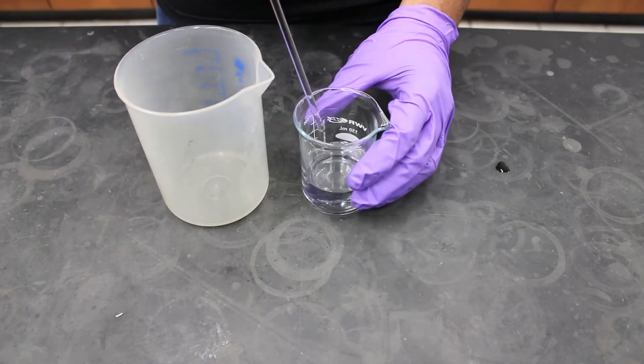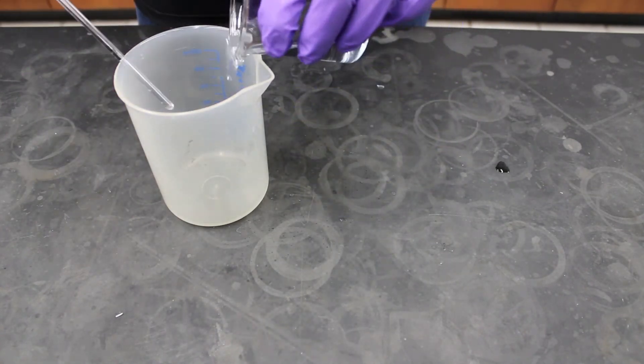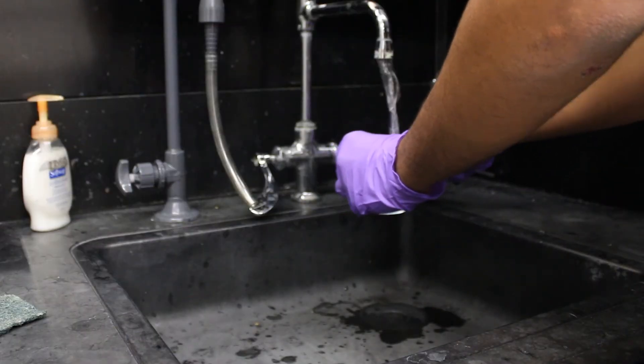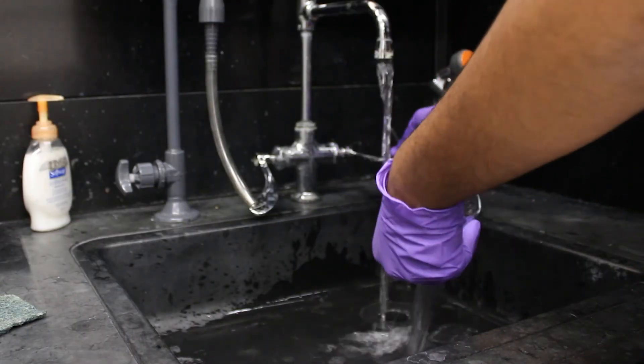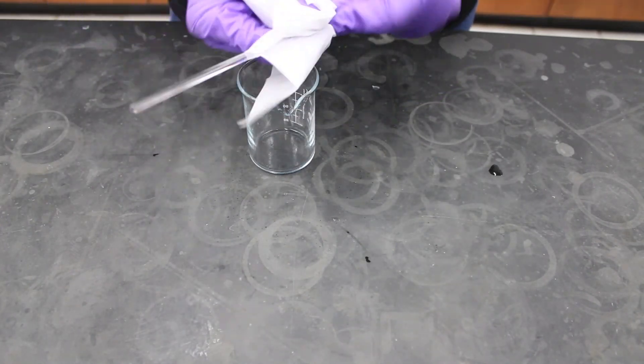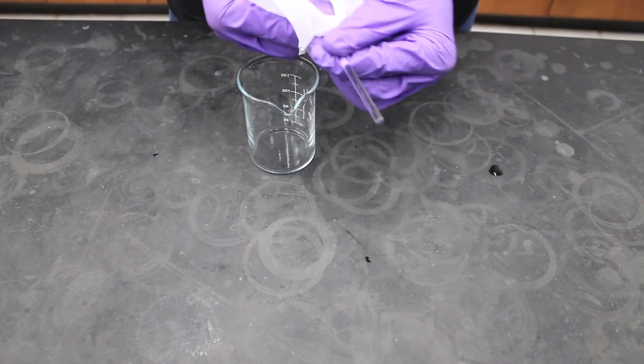Now pour out the solution into a large plastic beaker. Wash your beaker and glass rod in the washing area. Dry the glass rod and the inside of your beaker with Kim wipes.